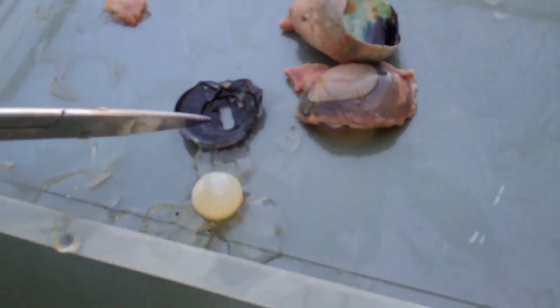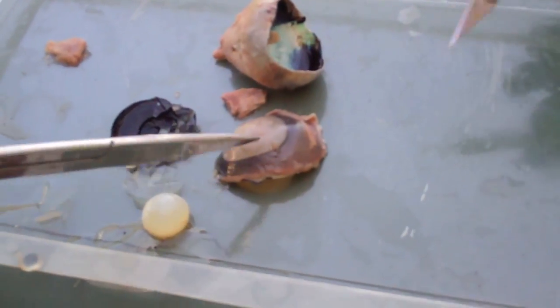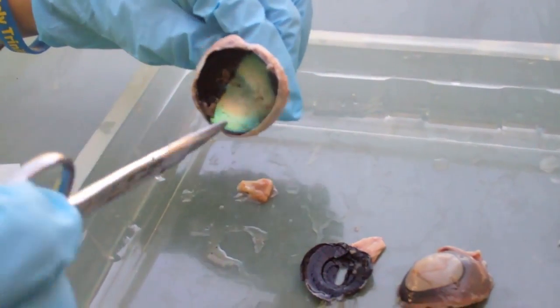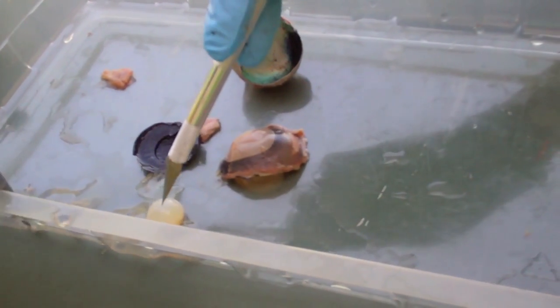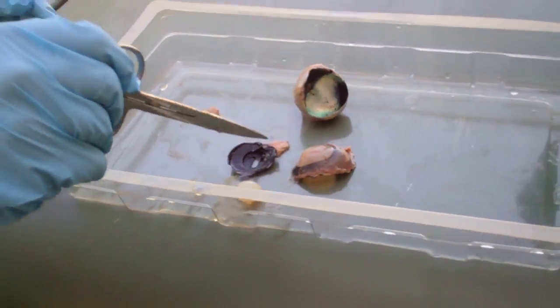So this is the iris, and then this is the cornea, and here is the retina that we took out. And then this jelly-looking stuff is the vitreous humor, and that is the lens, the little white thing.